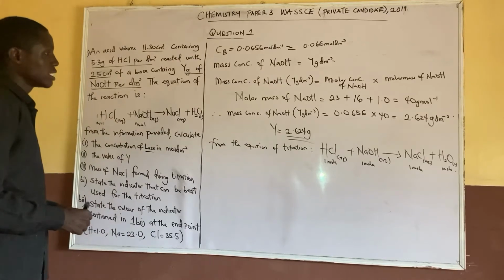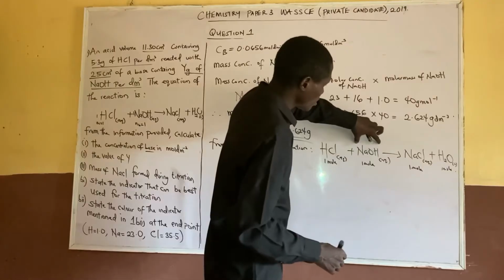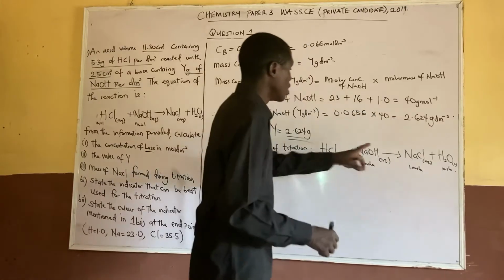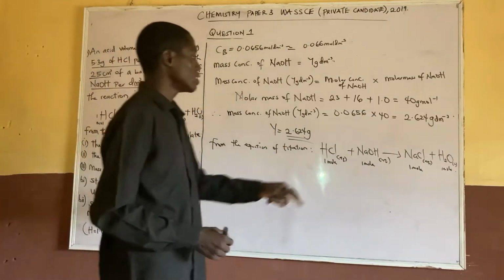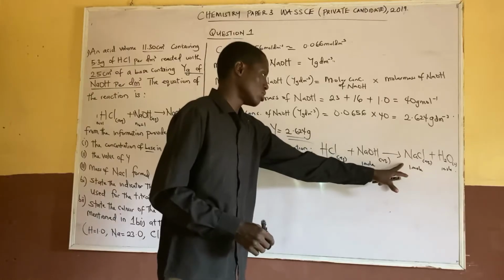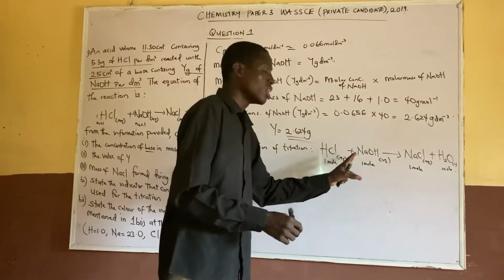If that is the case, the same number of moles of sodium hydroxide produces the same number of moles of sodium chloride salt. So now let's look for the number of moles of sodium chloride after the titration, since they ideally react in ratio 1 to 1.